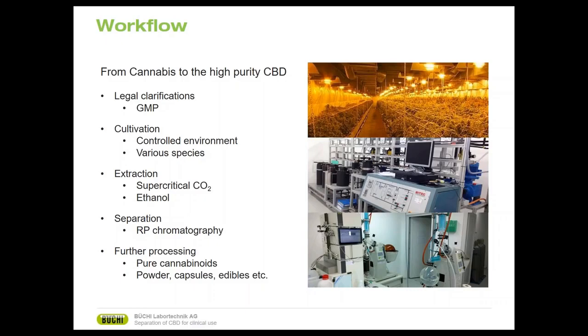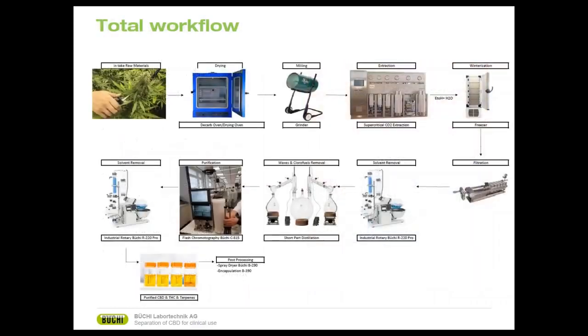This was the overall workflow, and I would like to dig into more detail with the workflow, which instruments we use and which parts we will take a role in, because this is the general main workflow. So this is the total workflow in more depth. Now let's take a look at the total workflow with each step in detail.